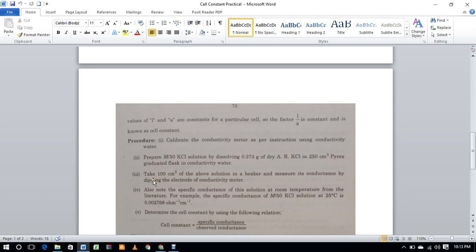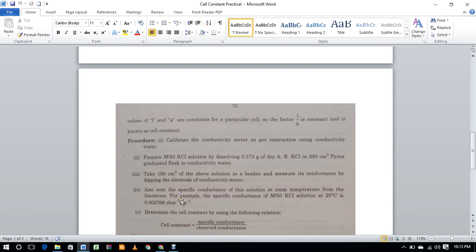Take 100 ml of the above solution and measure its conductance by dipping the electrodes. Also note the specific conductance of this solution at room temperature from the literature.